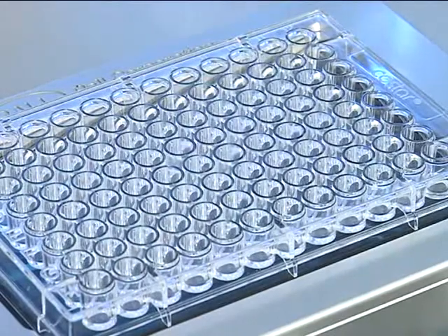First, place a 96-well micro-titer plate on the vacuum manifold. Note this is not your 96-well filter plate but a hard bottom conventional plate.